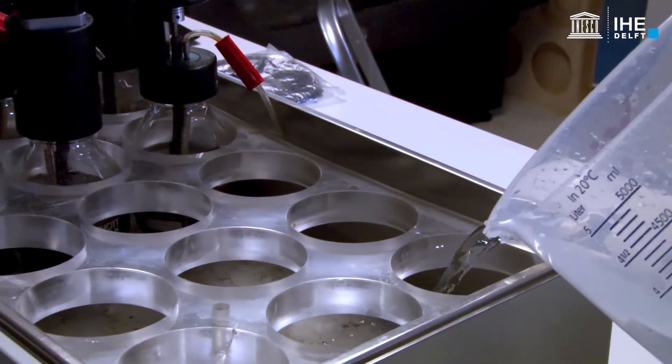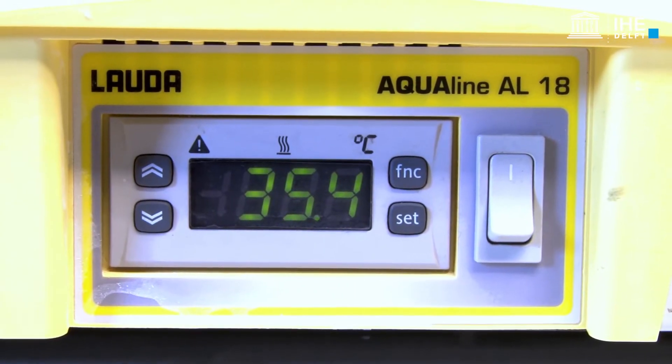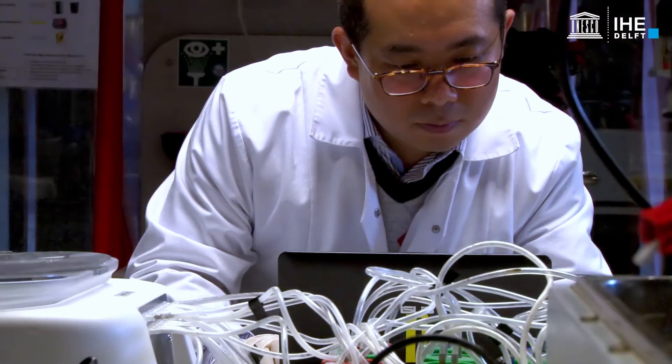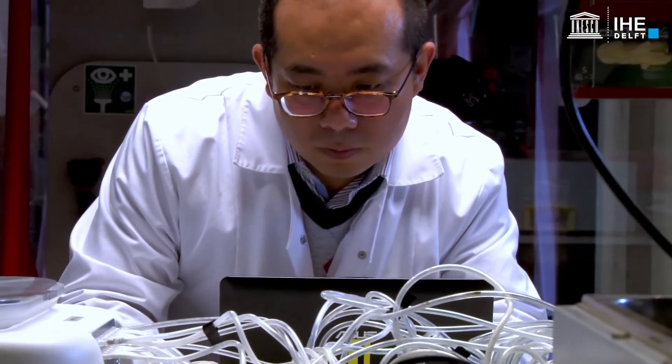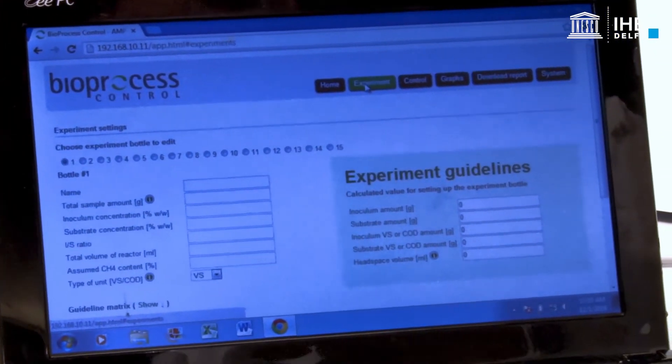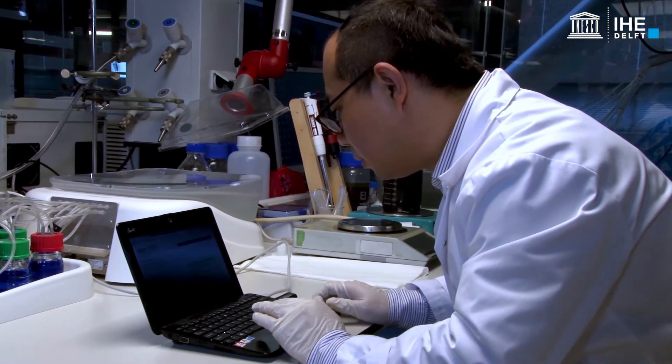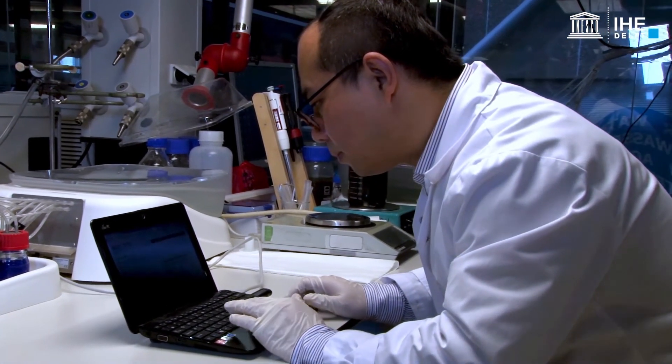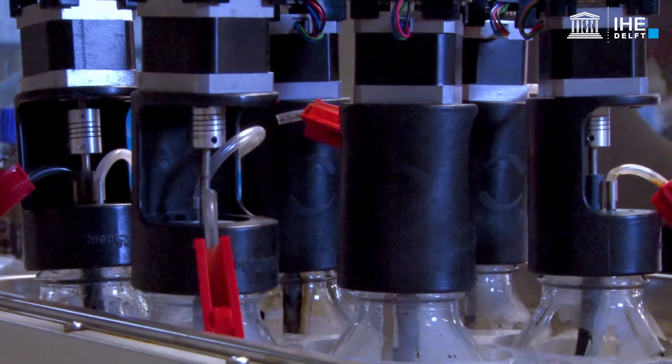Fill the water bath and set the temperature of the water bath. In this example, a temperature of 35 degrees centigrade is used. Input the names of the samples and set the parameters such as COD or volatile solids of the substrate and volatile solids or volatile suspended solids of the inoculum in the program. Then start the motors and the program.